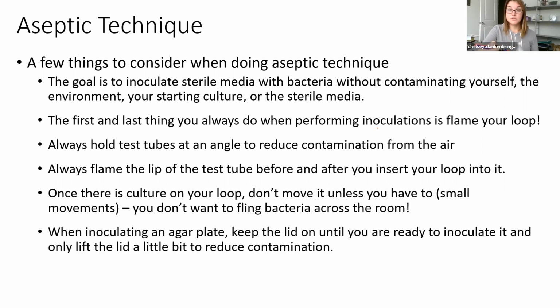And then the last thing you always do is flame your loop again, so that way you can set it down and go about your business. Okay, so you always start and end with flaming your loop. Okay, I'm gonna go off camera now.